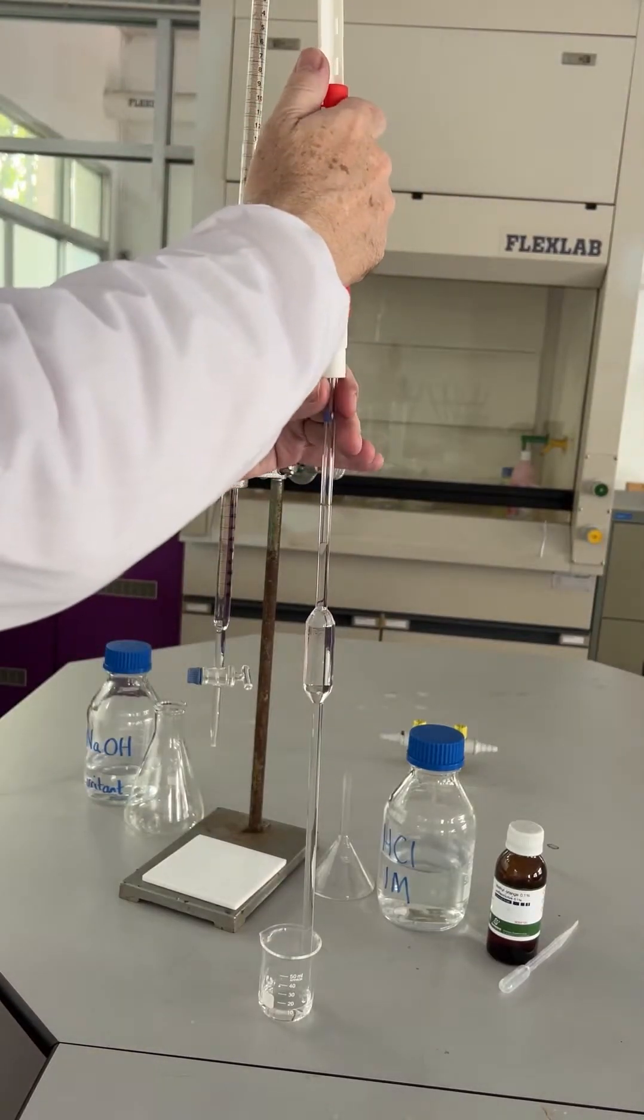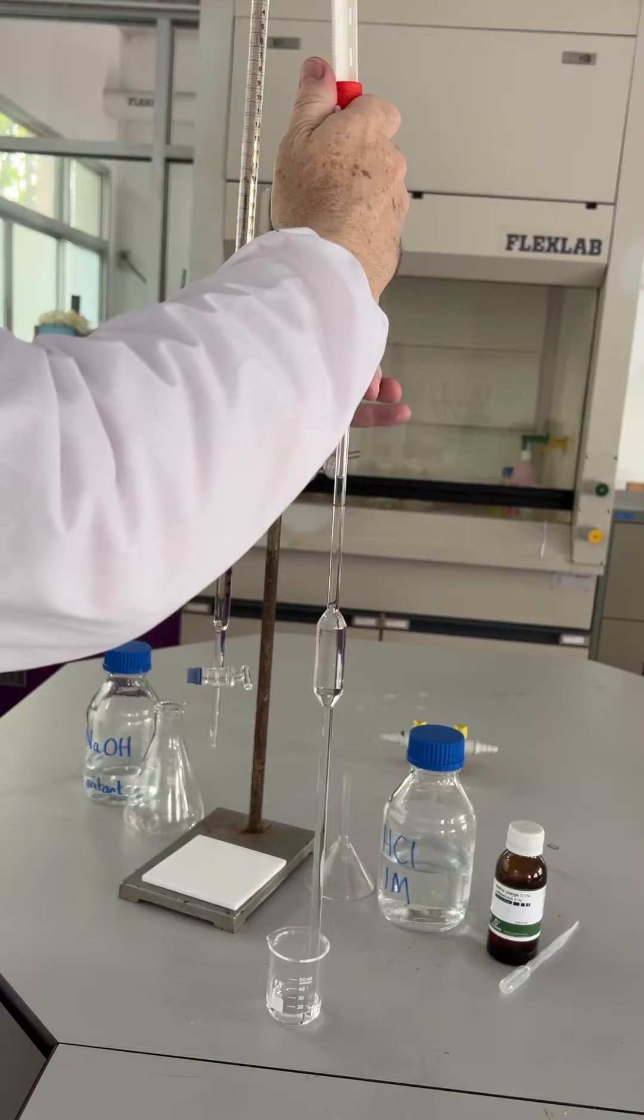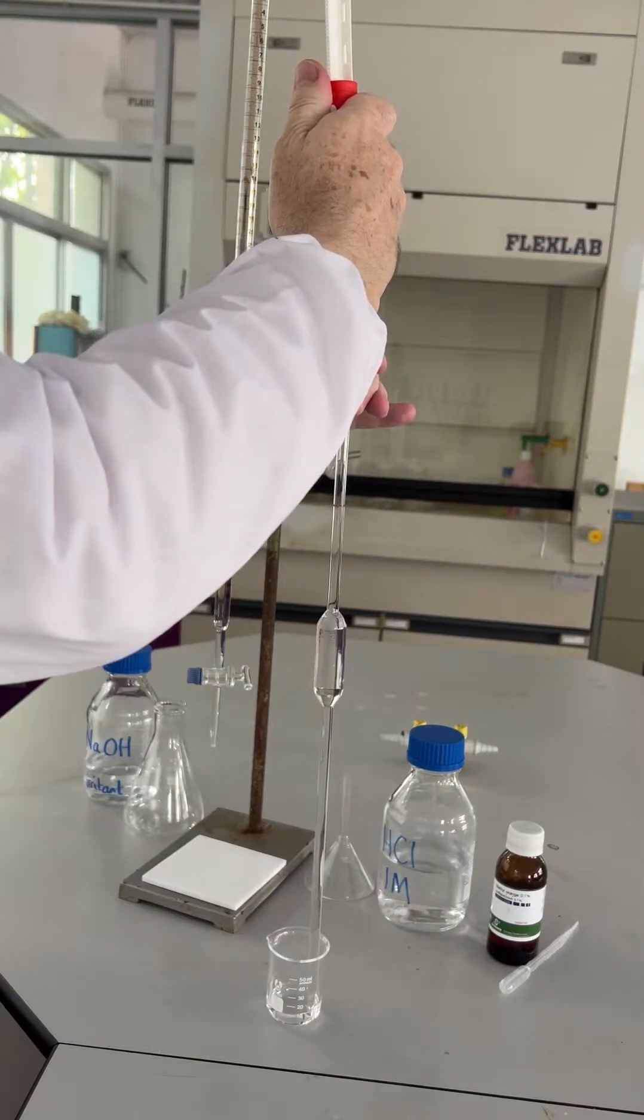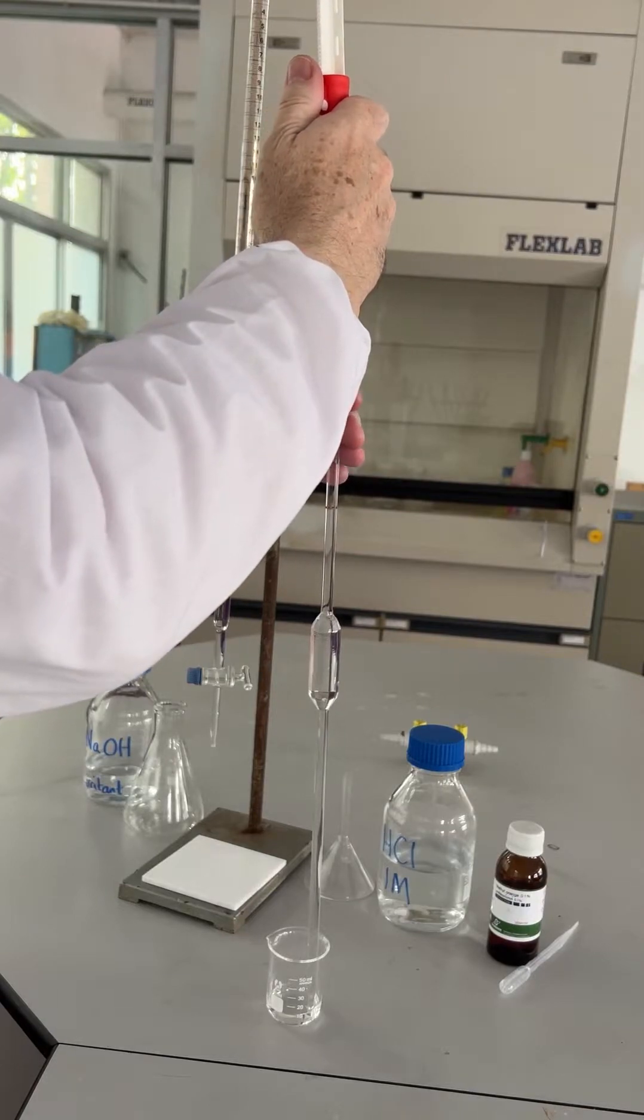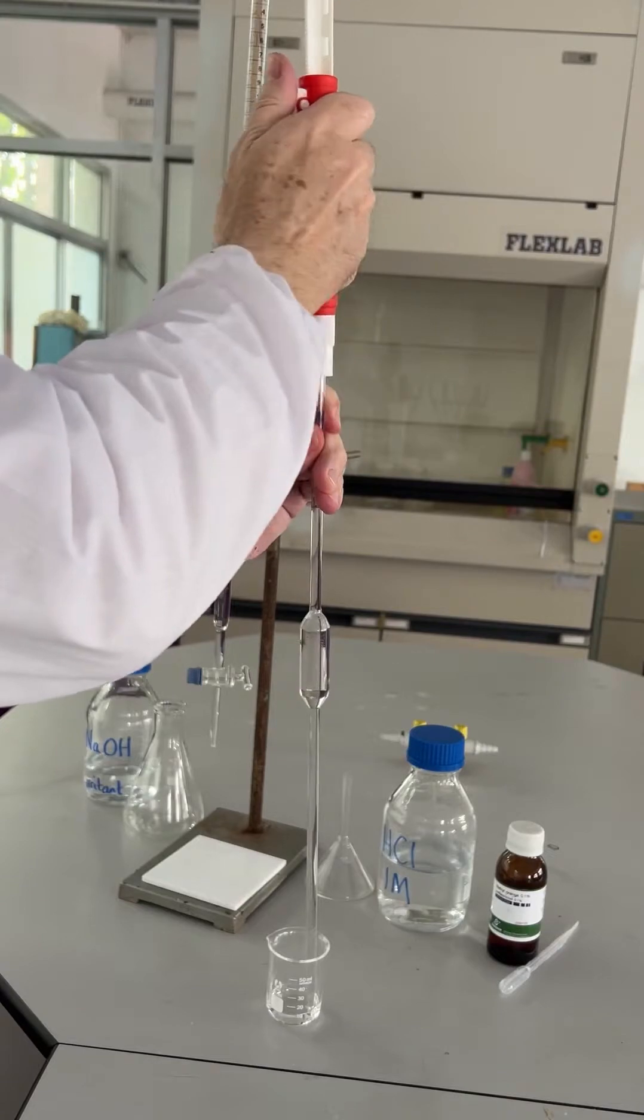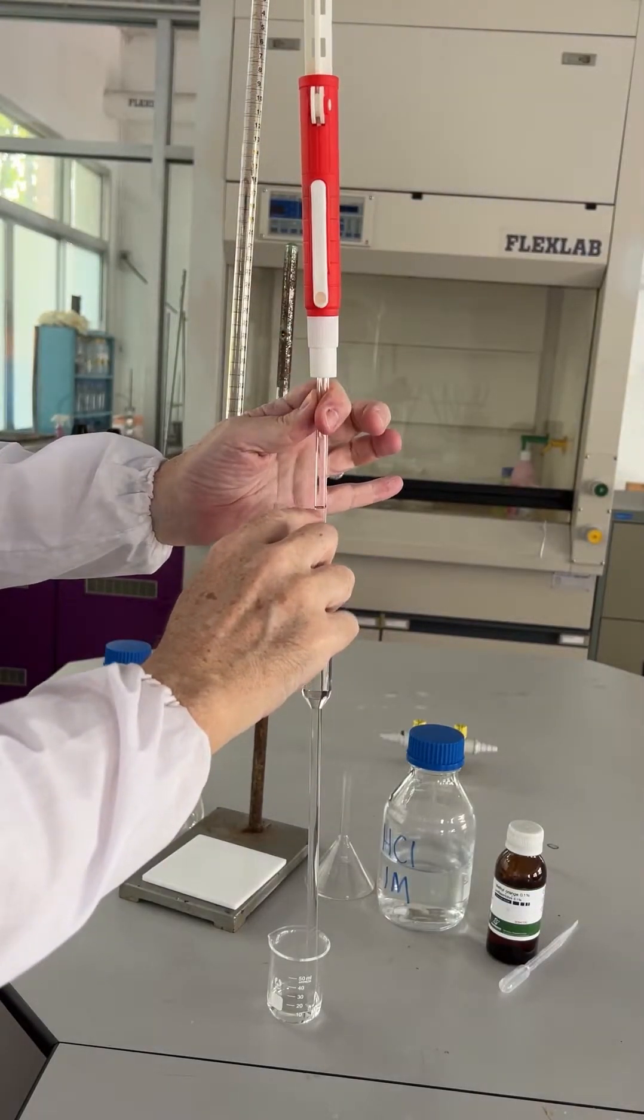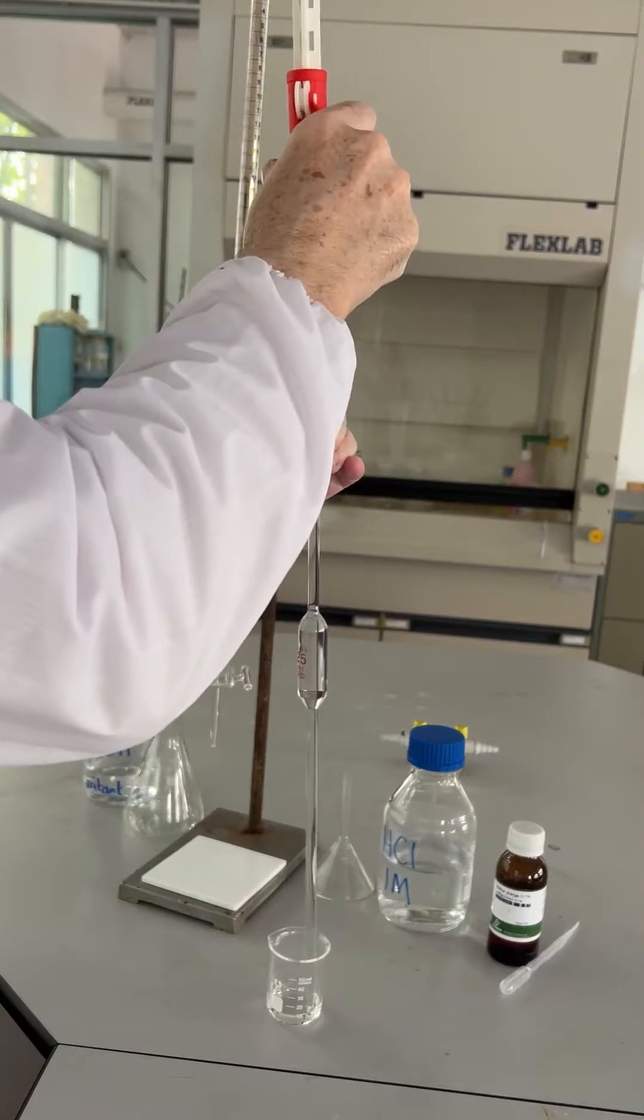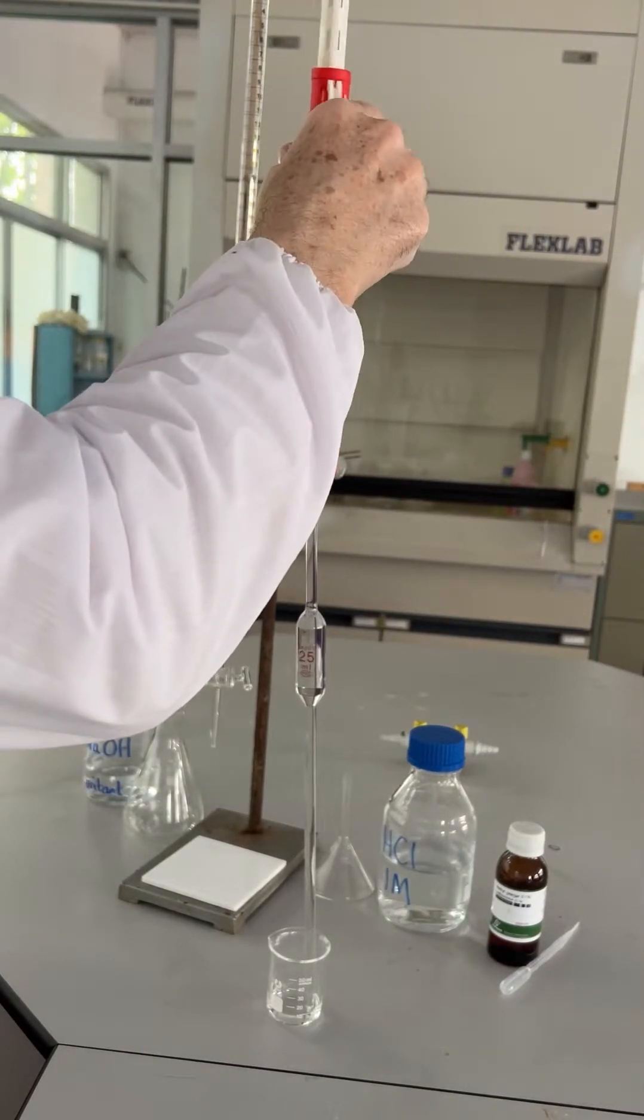First we pipette 25 cubic centimeters of the sodium hydroxide into a flask. We're using a pipette filler but I prefer to lower the volume using my finger. So we're going to lower the level of the fluid down to the line. And as I say, I prefer to use my finger here.